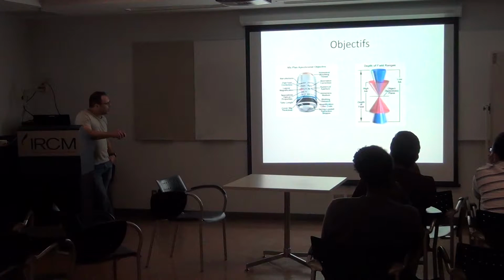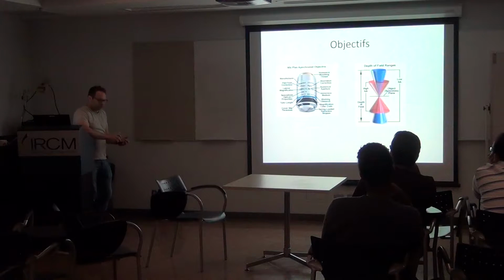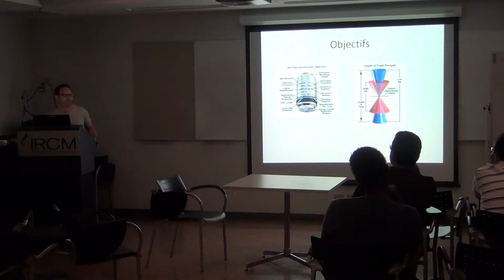Also, high magnification objectives, since they go really close to your specimen, usually have a spring so that the lens can enter inside. If you move the focus too high, the lens is going to retract into itself, and you won't break your specimen. When you get so close, if you go really hard, it's going to crack your slide. So still be really gentle with high magnification objectives. Don't go too fast or use the coarse focus.